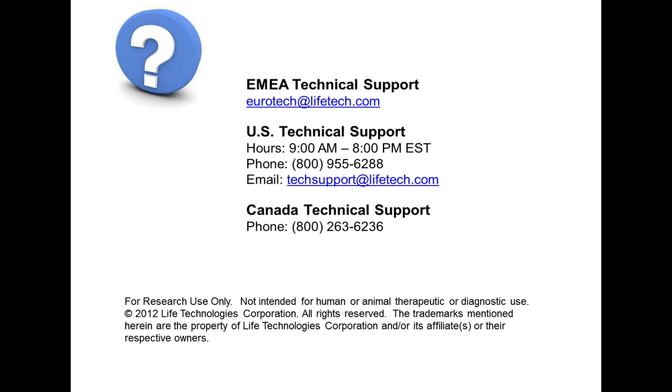So there's a question on different colors of the laser, such as violet and yellow, and what does it represent? These actually represent different wavelengths along the light spectrum. When we refer to a violet laser, this refers to around 405 nanometers in wavelength. A yellow laser would be 561 nanometers. That represents the excitation wavelength, and it will help determine what fluorophores or what reagents you can use with that system.